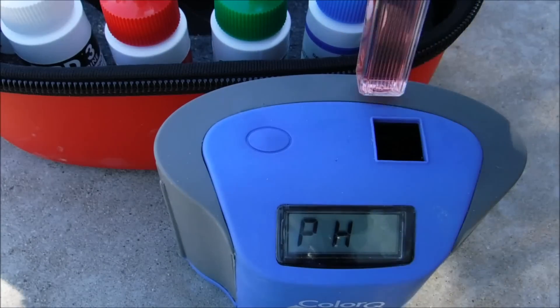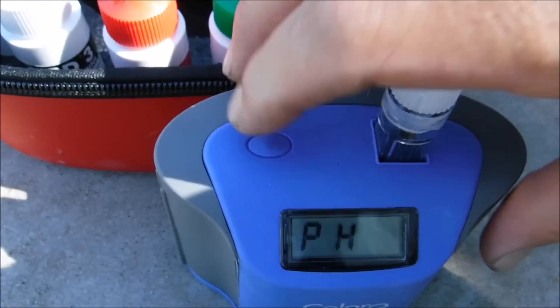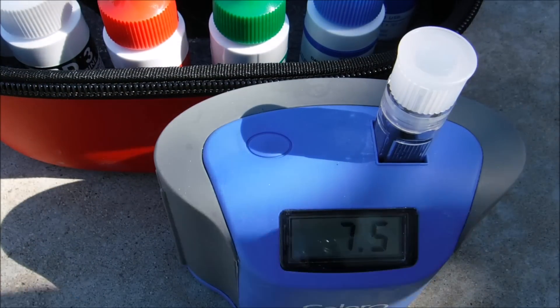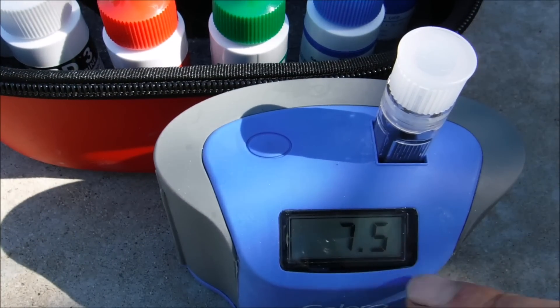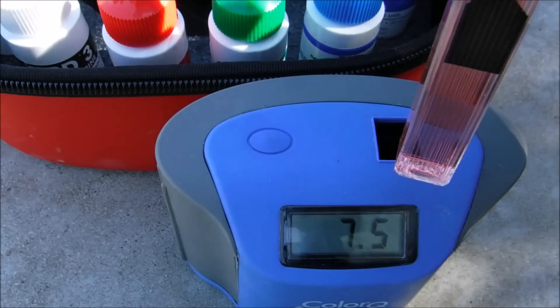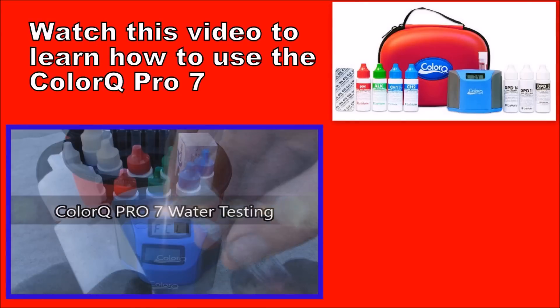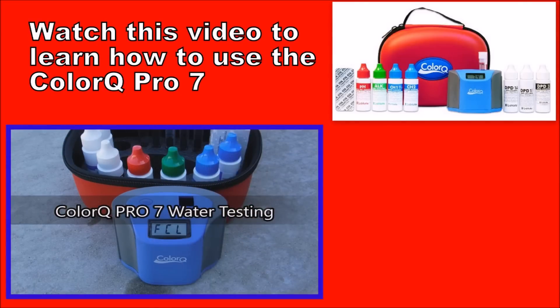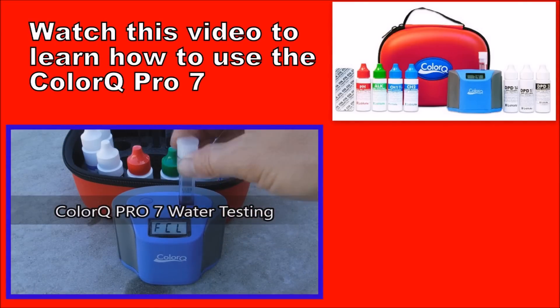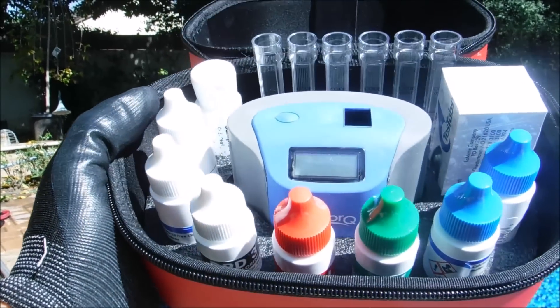Then you simply take the sample and slide it into the ColorQ with this button here. That'll give you the pH reading — in this pool it's 7.5. You do the same thing for all the tests except for the cyanuric acid, which is a tablet test. It's really simple to use. I also have a separate video that goes into detail on using the ColorQ Pro 7 to do all 7 tests. It's a great way to test your pool to keep the water balanced, and it has a very easy-to-read digital readout.